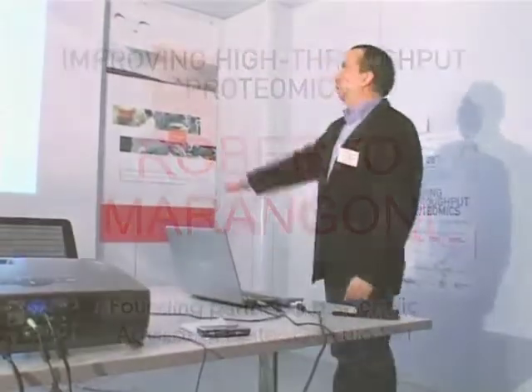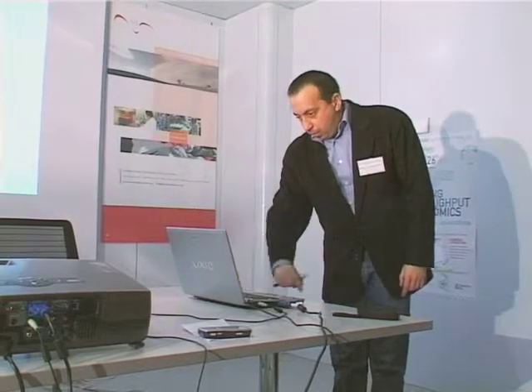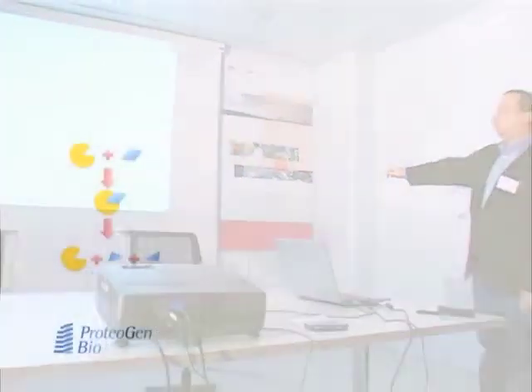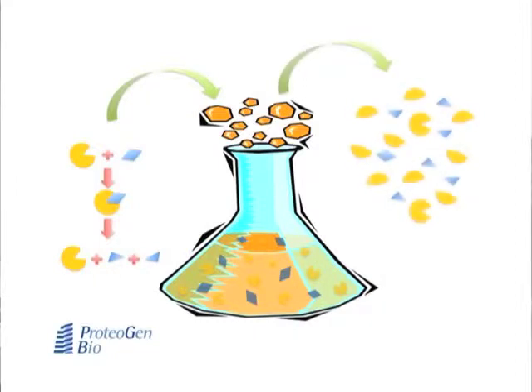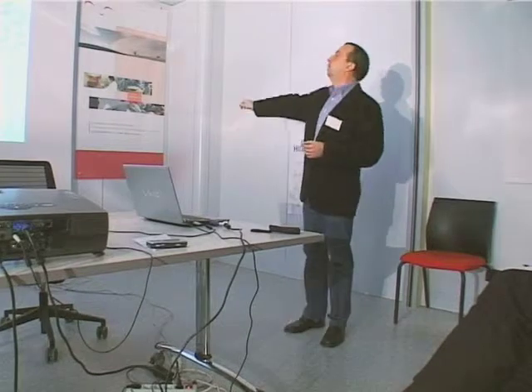And then last, post-translation modification. And in particular, when we have a peptidase, this peptidase cleaves proteins and cuts them into different parts. If I use the peptidase in solution, then my final result is a mixture of fragments coming from the protein to digest and from the peptidase itself.